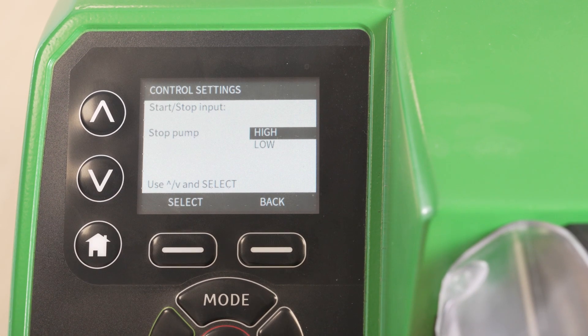Select the required input sense to stop the pump. The input sense refers to the status of the signal required to implement the control action. In this example we're making the selection for control input of stop pump. We change it to low.